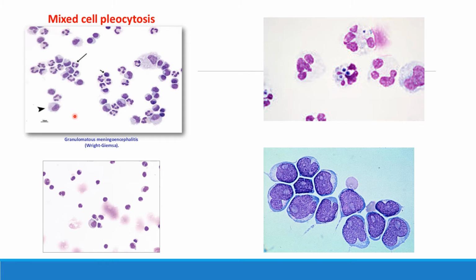These would obviously be some kind of inflammatory situation. And in this particular case, it happens to be a granulomatous meningoencephalitis. So this patient has inflammation of the meninges and brain tissue.